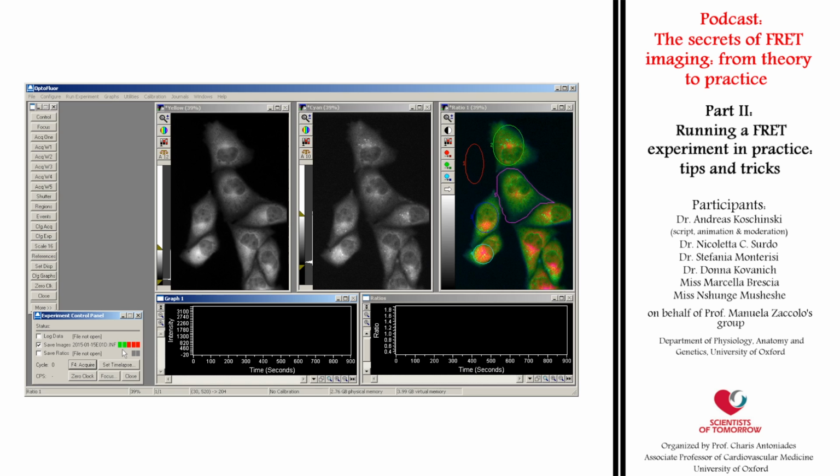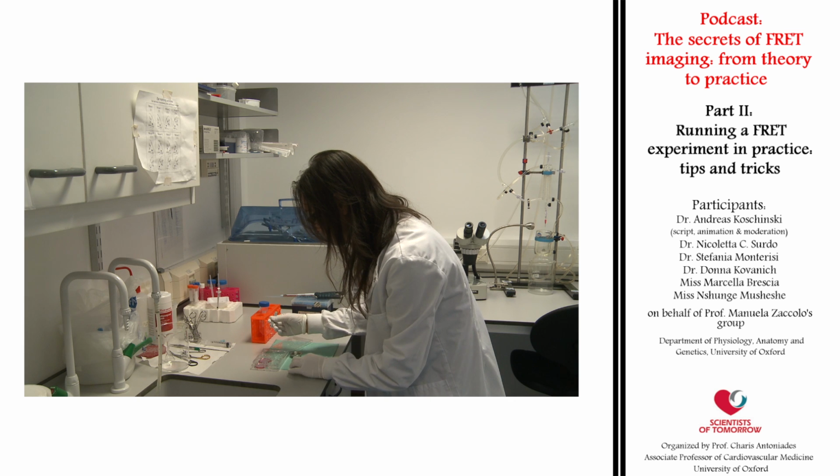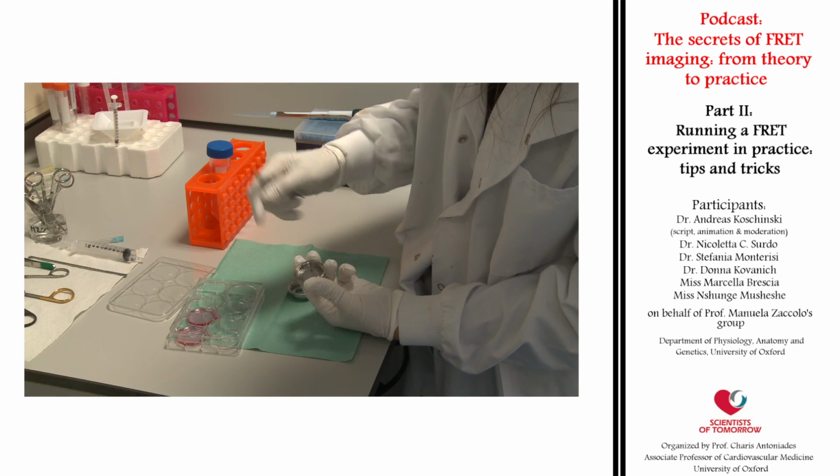Until now I have shown you all the setup procedures with the CHO clone transfected with a cAMP sensor. For the sample experiment, we will now return to the transfected cardiomyocytes my colleagues prepared for this movie 48 hours ago. Here you see Nicoletta preparing the cells for the measurement. First she mounts the cover slip into the bath chamber.